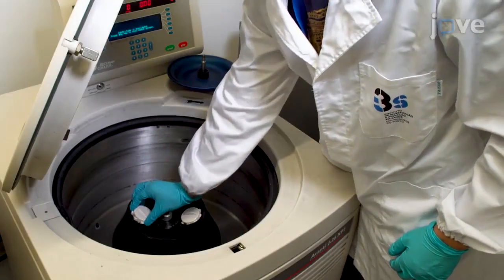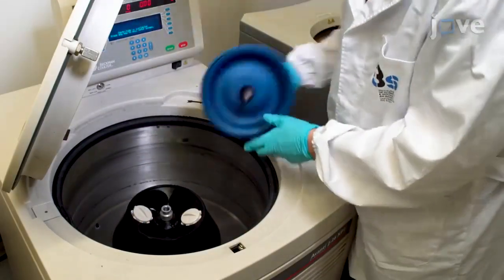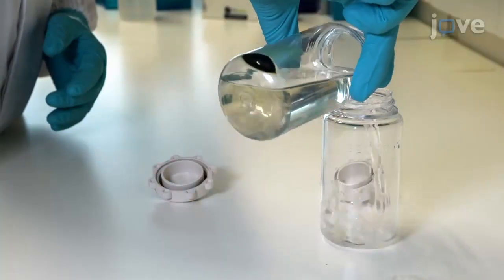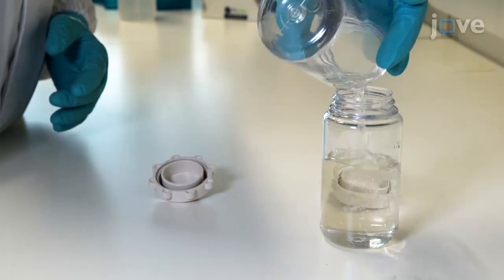Centrifuge the culture at 15,000 times G at 4 degrees Celsius for 15 minutes. Transfer the supernatant to a new vial and discard the pellet.